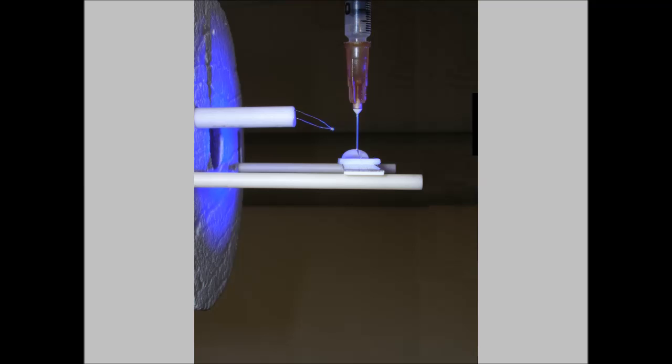Using this heating microscope, it is much easier to carry out surface tension measurements at room temperature, since it is possible to set the drop in place on the substrate directly in the focal spot of the camera.